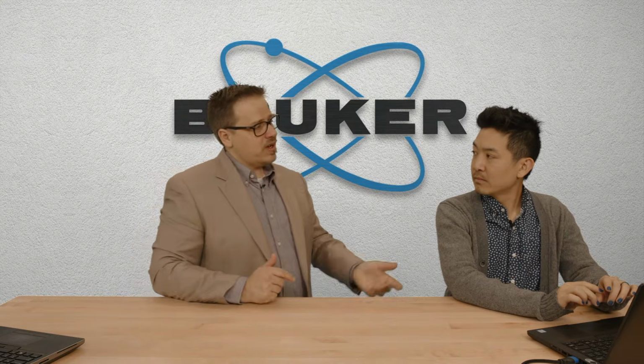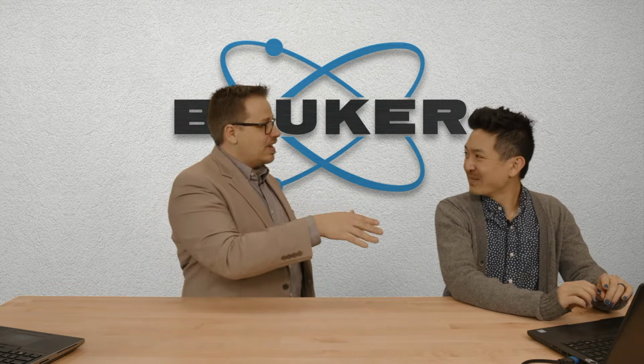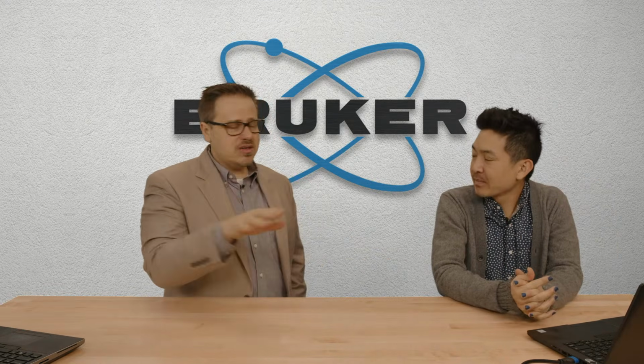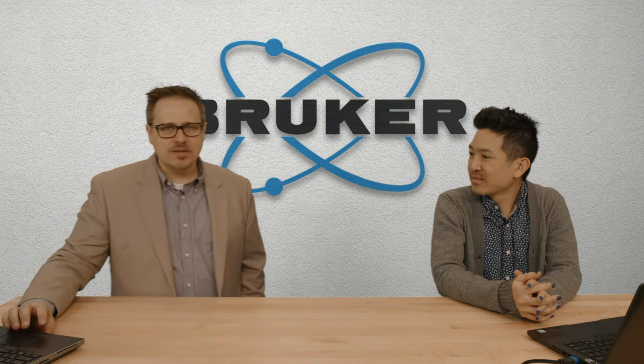One thing I learned today, which is very important, is that we need another episode of EVA, where we can dig even deeper into some of this. In particular, you can do some fitting and stuff like that. Basic fitting. If you want to do really high-end fitting, Topas is the place to go. But here you can do some great fitting. So let's get to some of the questions that have come in.